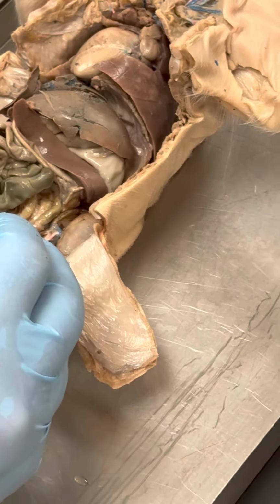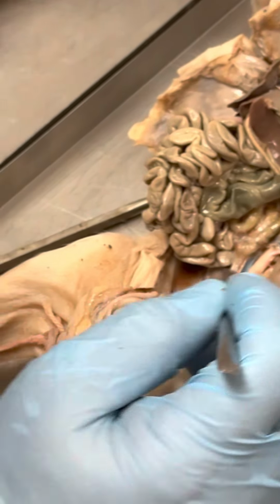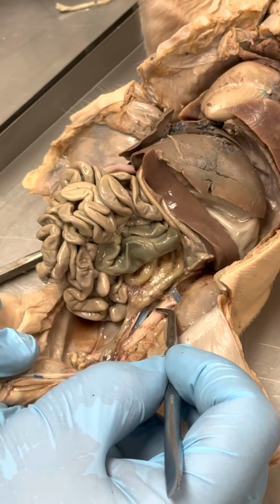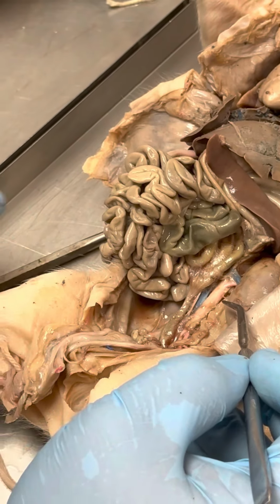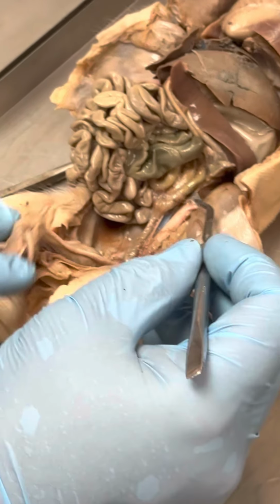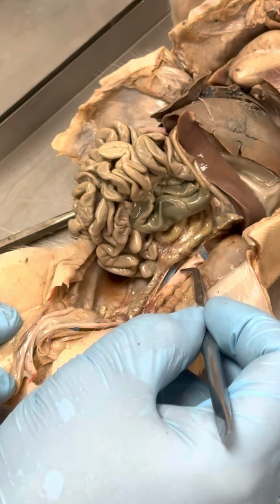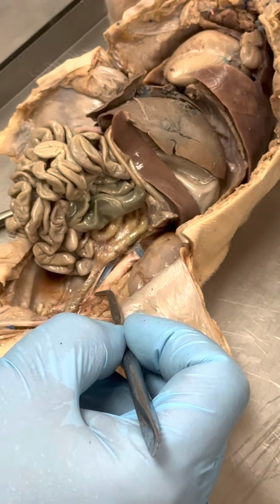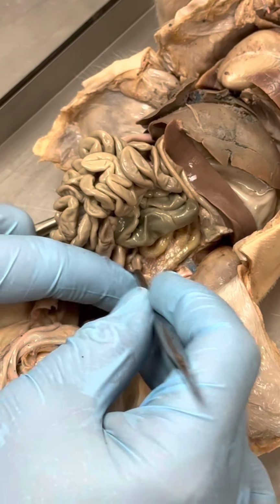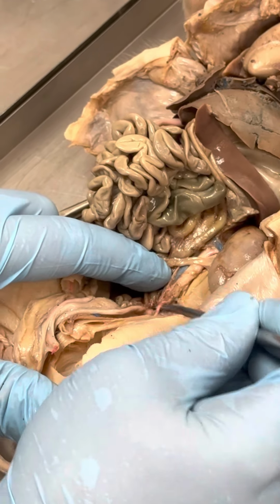On to our iliacs. Well, we'll use this one. So you follow that. Ooh, somebody broke the colon there. You? It was broken when it got here. So we got abdominal aorta, and then it's going to branch. That's not it. That's your ureter. So this thing right here, that's your iliac.